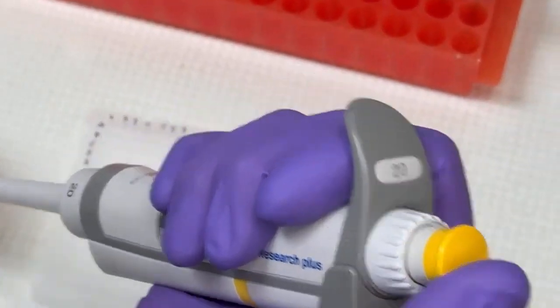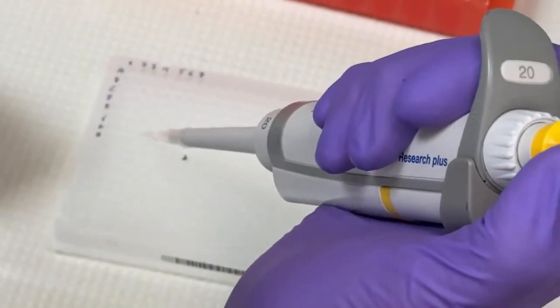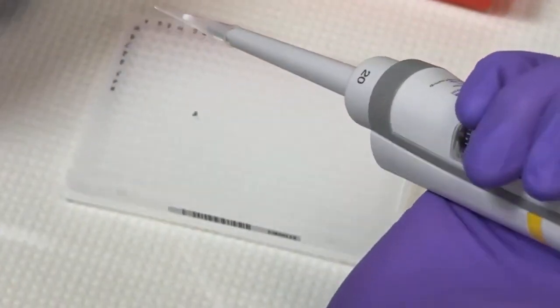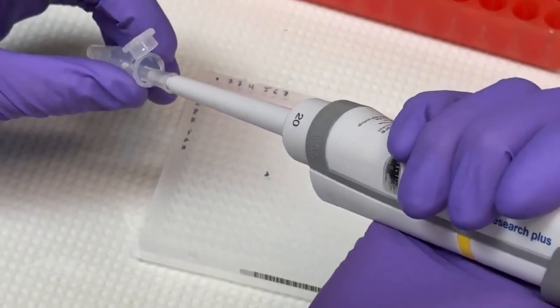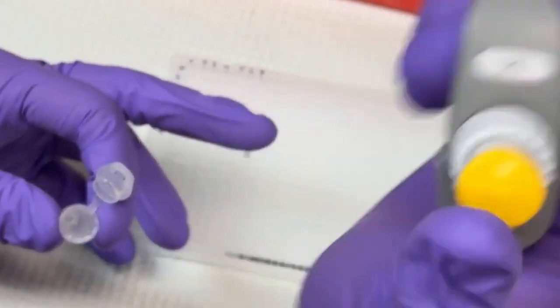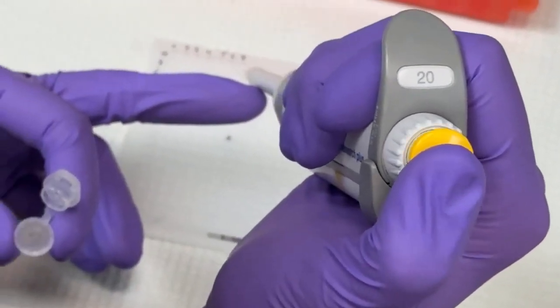So we're almost done with the 18S addition to the plate, and then I will move on with the TERT. 18S and TERT are both really common, really good endogenous control tests. We're going to see how they compare against each other.